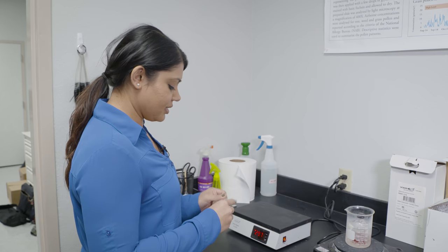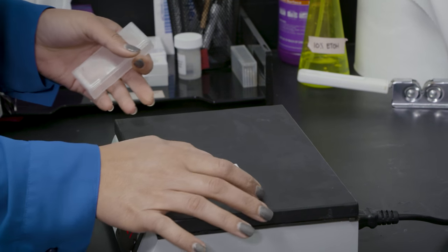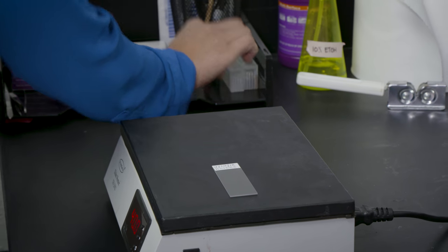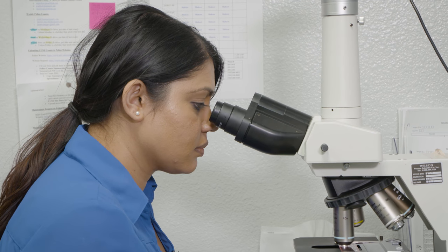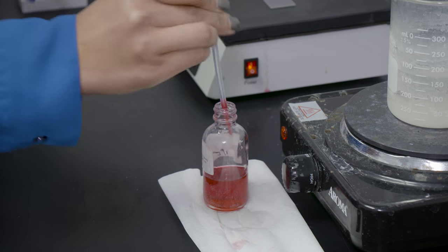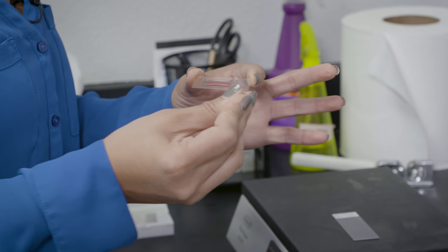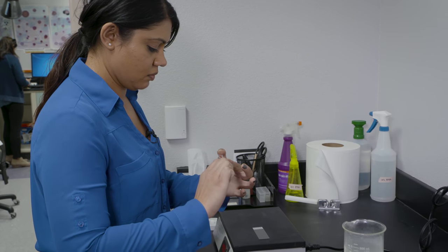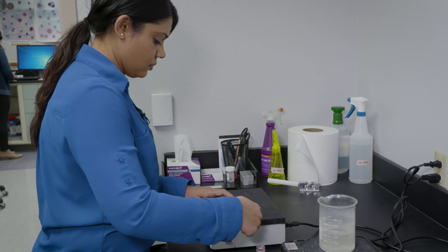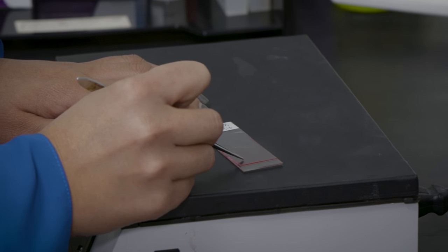After we collect the slides from the samplers, we put them on a slide warmer. The pollen grains themselves are clear if you look at them under a microscope without the stain, so we need that purple pinkish stain to penetrate the pollen grain. We warm it up so it opens those grains to allow the stain to penetrate, and once it's dry—about 15 to 20 minutes—we're able to analyze it under a microscope.